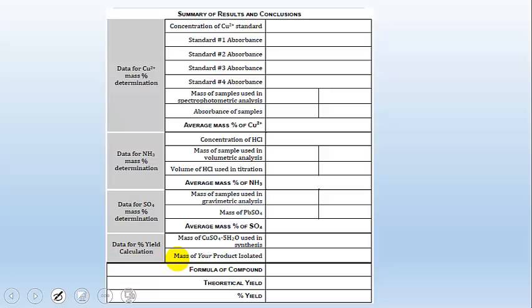Okay, back to our summary sheet. This is the first page. Now we are doing this. Okay, so this is week 2. Concentration of HCl. This is right from the bottle. Okay, it's about 0.5. Okay, but you should put in what it actually is there.